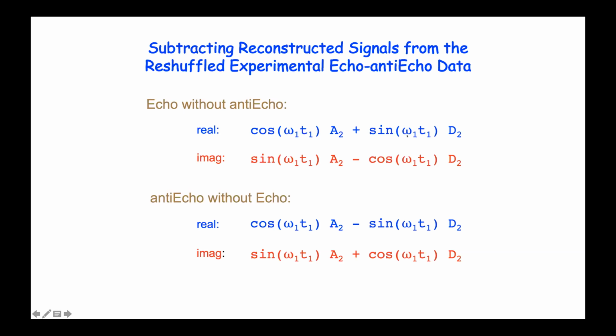but then from the sine and cosine, it tries to reconstruct the data that's in the input data and then subtracts it to remove each peak. And whenever a peak is removed, the artifacts associated with the peak are also removed, including the artifacts which are dispersive. And when the other component is sampled, SMILE does this: reconstruct cosine and sine, recombine this cosine and sine to get this kind of data set, and then reconstruct it.